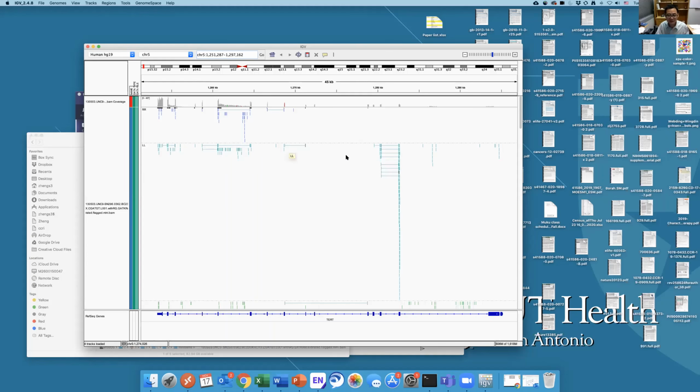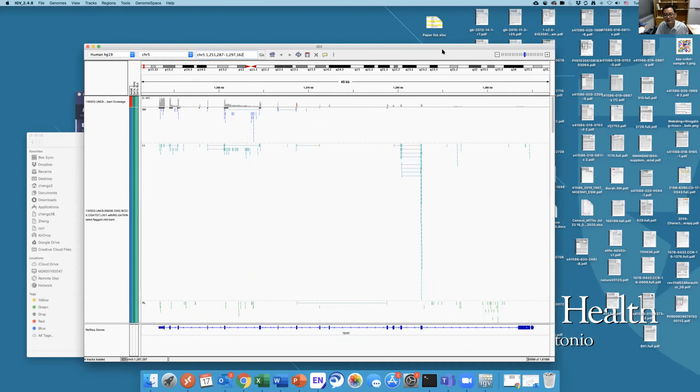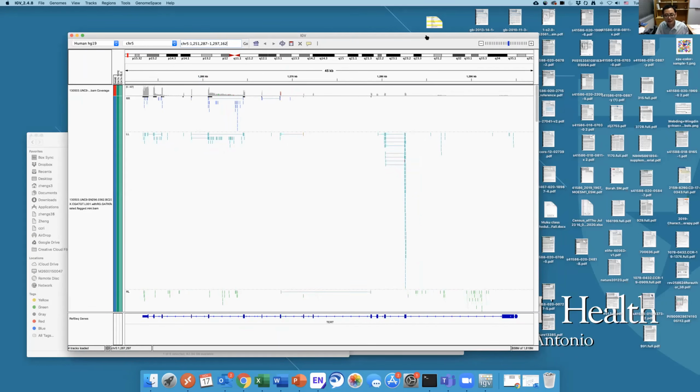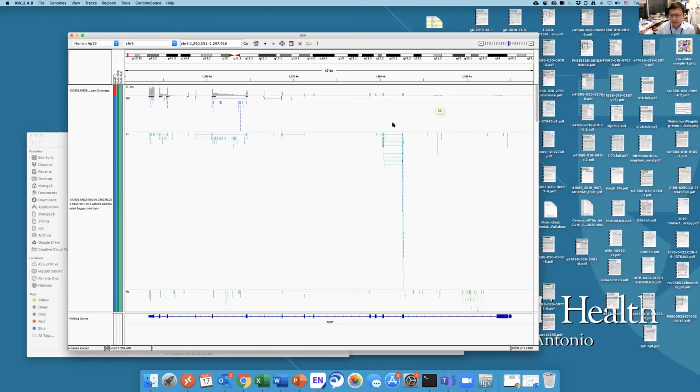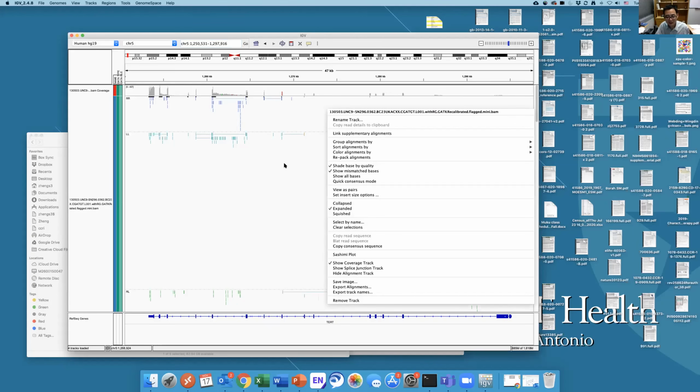The reason I kept this file, I kept the third gene, is because I was interested in studying the alternative splicing of TERT, only TERT. So that's why I only kept the information on TERT, but not any other gene in the genome. Now it's a new one, you have the other gene information there. This one, all the BAMs I have are on TERT. So yeah.